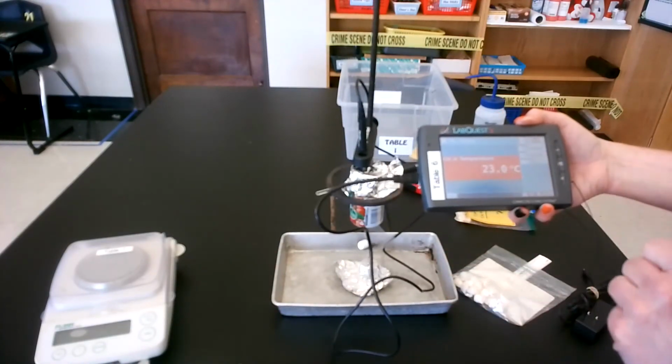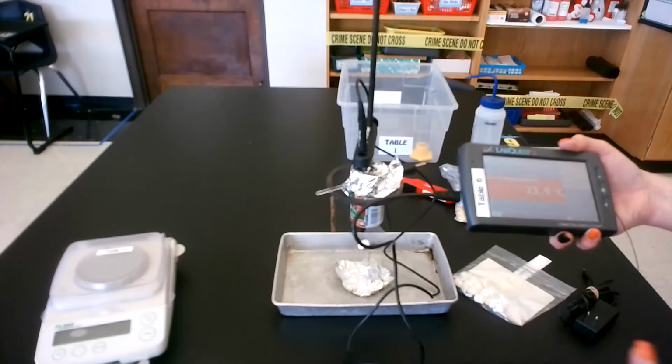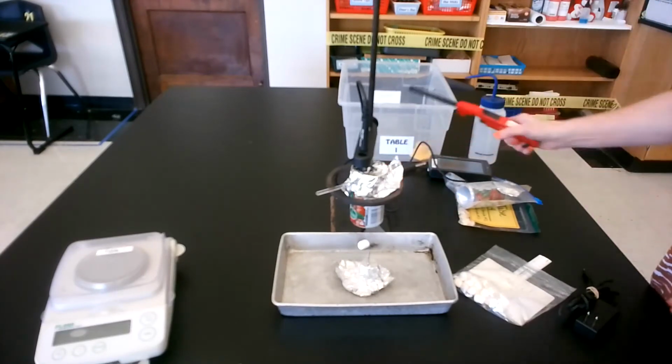So someone's going to be monitoring this. We want to have our initial temperature and then whatever the max temperature is, and that's going to be recorded in our data table also. So now I'm ready to go. I'm ready to start burning my food.